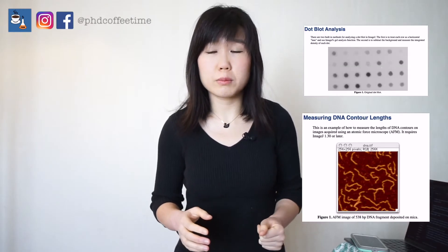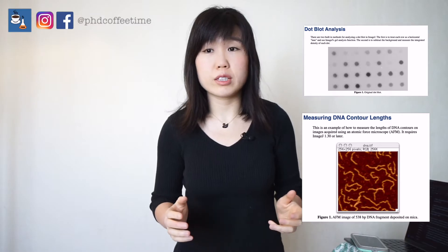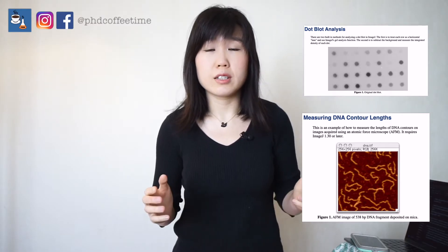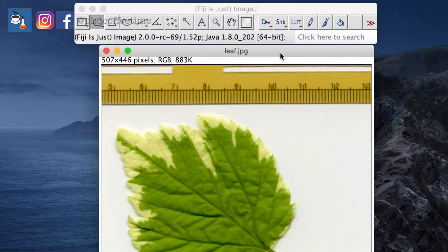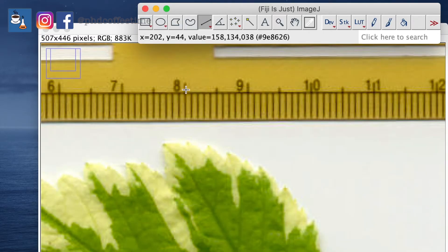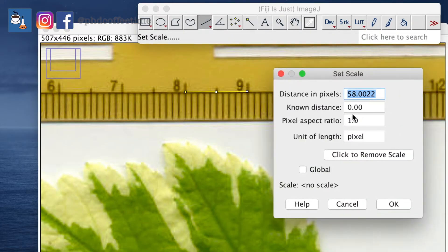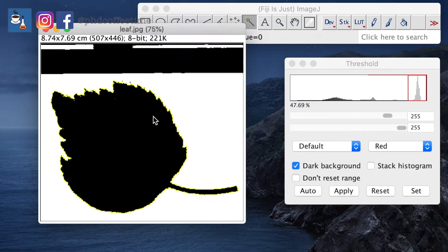ImageJ is a powerful tool for image analysis, and in research there are so many applications. We've figured out how to measure the sizes of animals from photographs by placing a ruler next to them — you can calibrate sizes and extract all this data from just image processing.